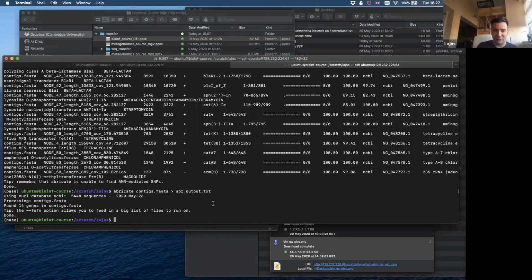Of course, there are many other ways you can analyze your final assembly, but these are much more, I think, study or biological question specific analysis pipelines. And I think this is covering most of those general ways how you can handle prokaryotic genome assembly.